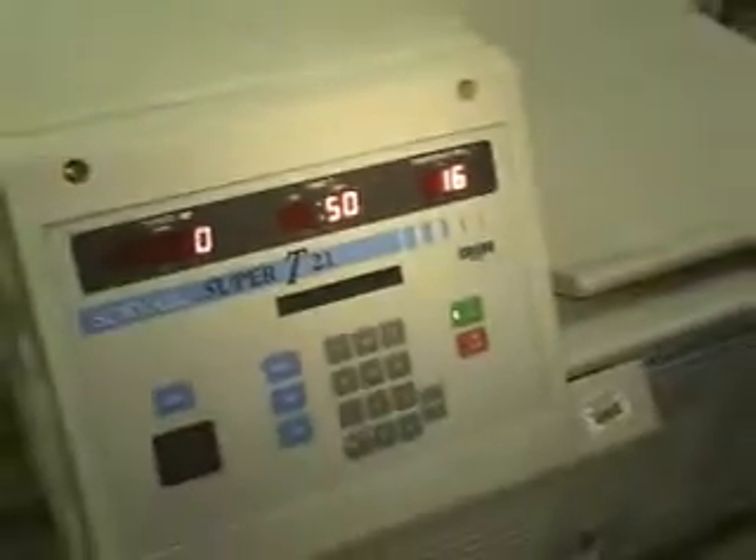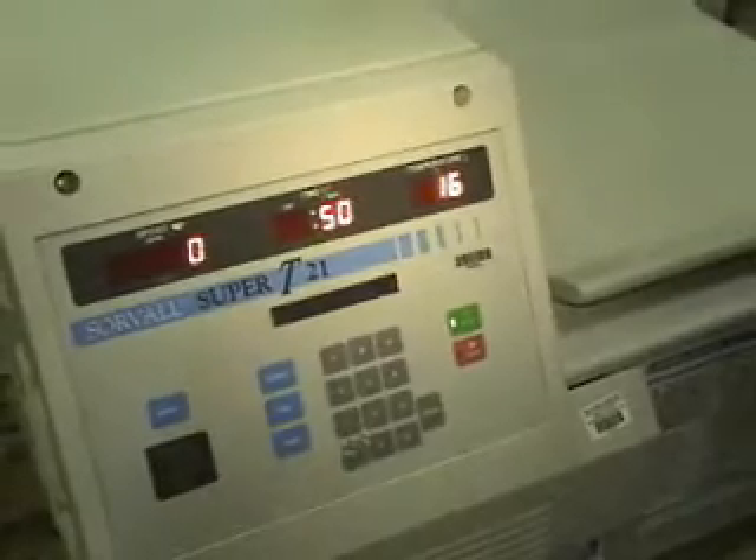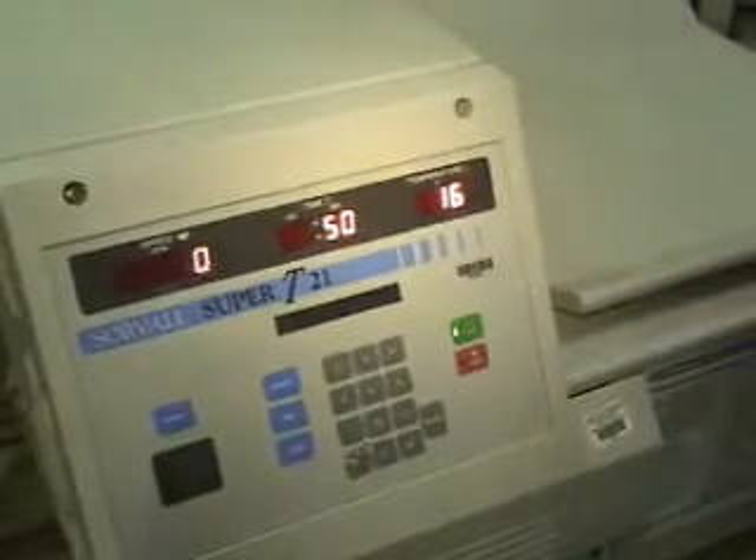I'm going to hit start. I know you wanted it to go up to 17,000 RPM, but we don't have the rotor to do that. So it's going to start up, and off it goes.